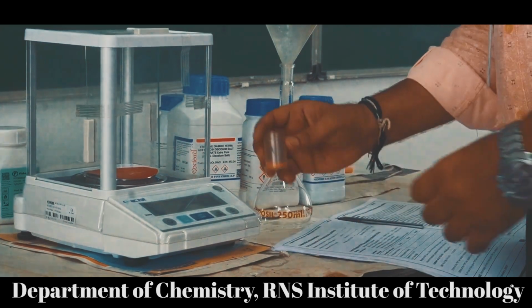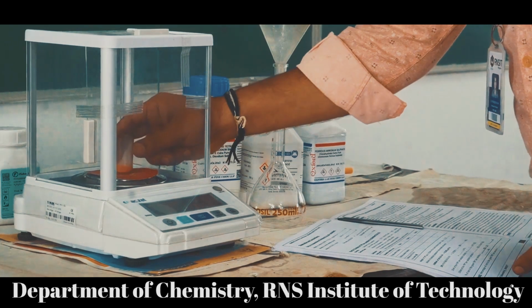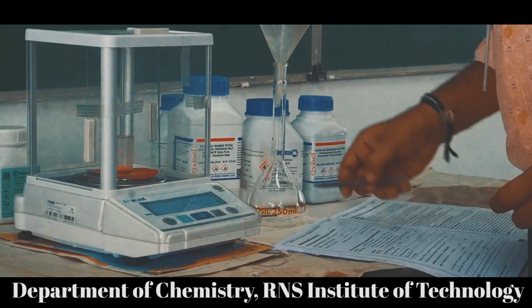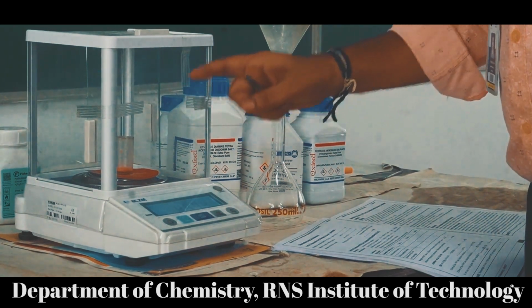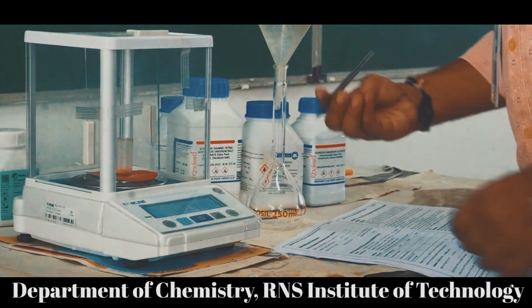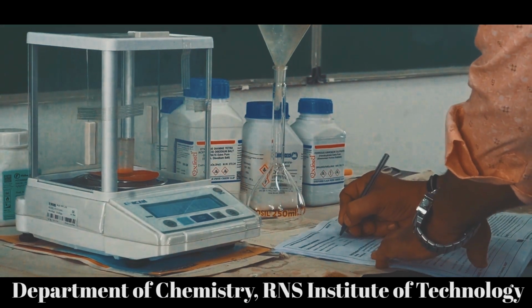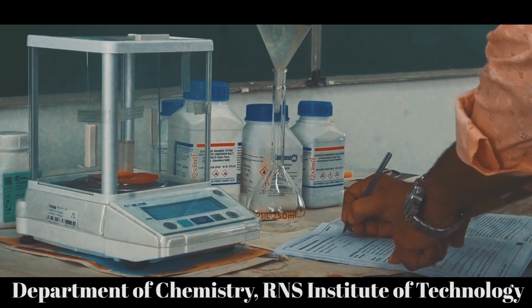First, you carefully place it on the pan like this, and it will show the weight of weighing bottle plus salt, and that will be 4.944 gram. Right? So this will be M1. So you can write this, 4.9446 gram.